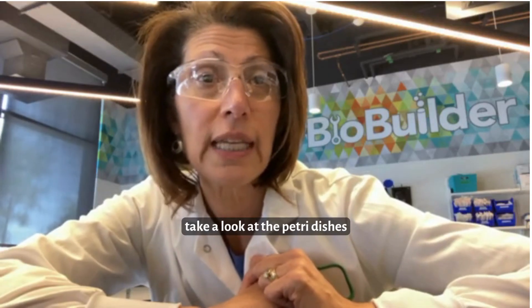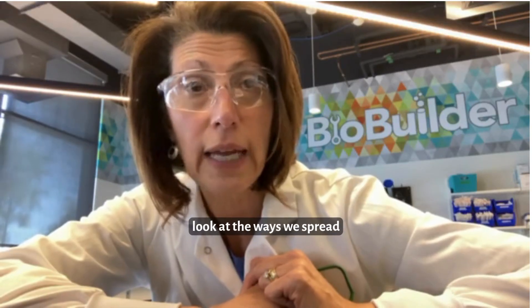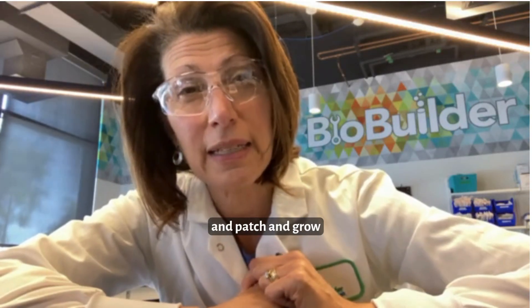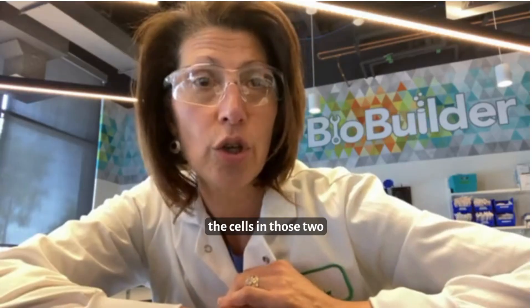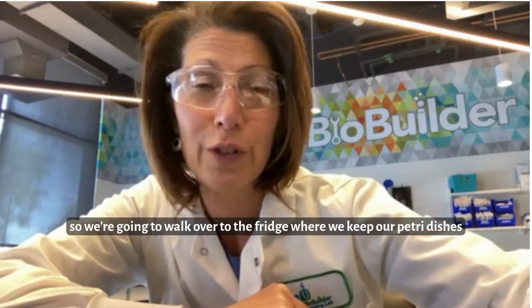So I thought we could take a look at the petri dish components and then look at the ways we spread, patch, and grow the cells in those two situations. We're going to walk over to the fridge where we keep our petri dishes next.